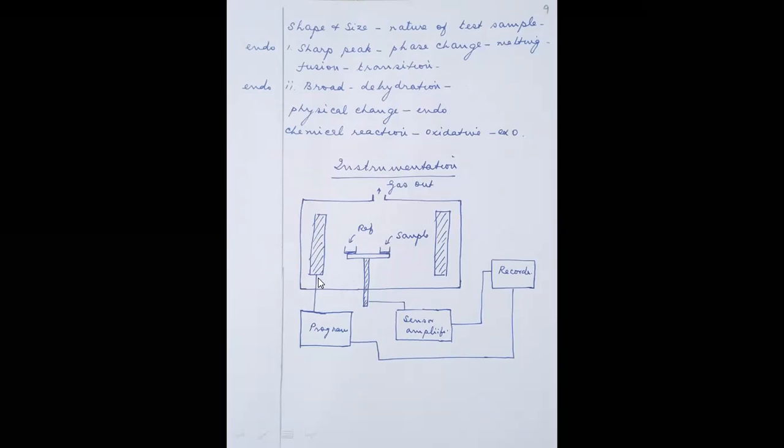and here is heating blocks. These heating blocks are also connected to a programmer using which you can gradually raise the temperature in a very pre-planned manner, because in all these experiments the temperature change should not be very abrupt. The temperature change should be very slow in rate, which means that per minute you can rise some half a degree or 1 degree, something like this.